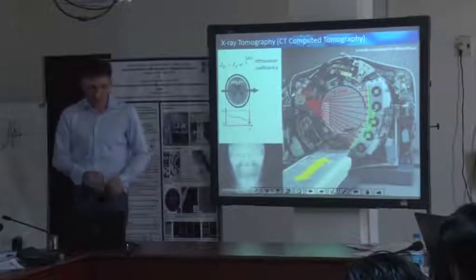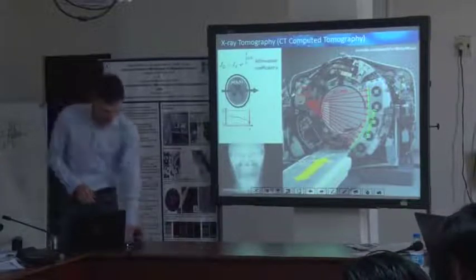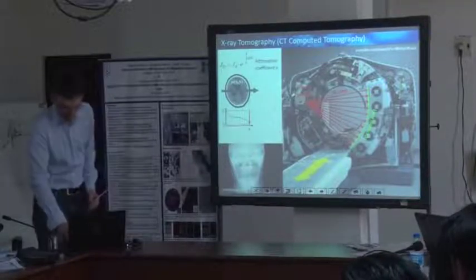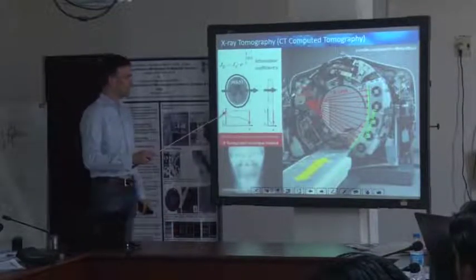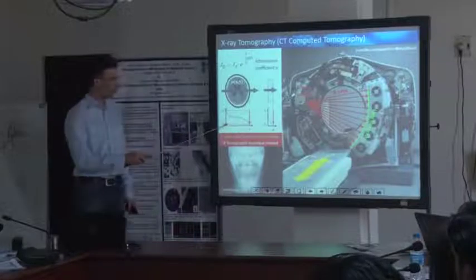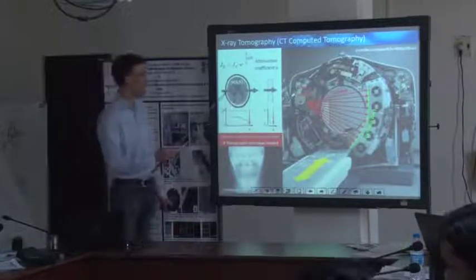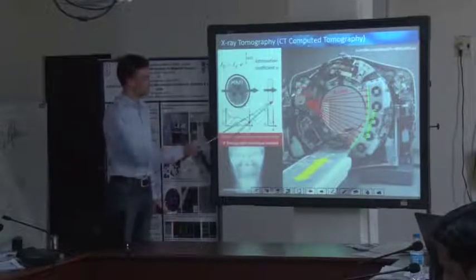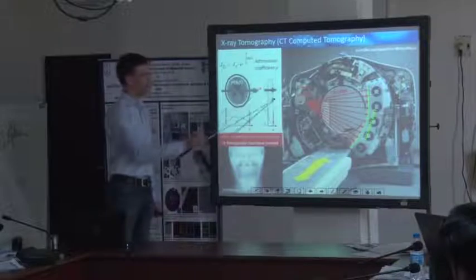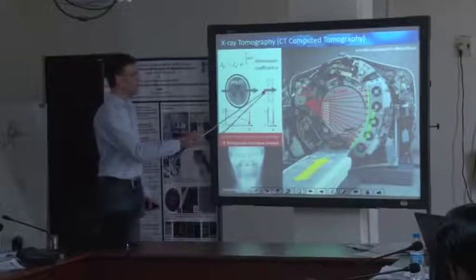But there are some challenges with this view in projection, because we don't really know. We just measure this intensity drop. We might know the initial current density or current. So we cannot distinguish between such a sample and one with just an intermediate or average attenuation coefficient.